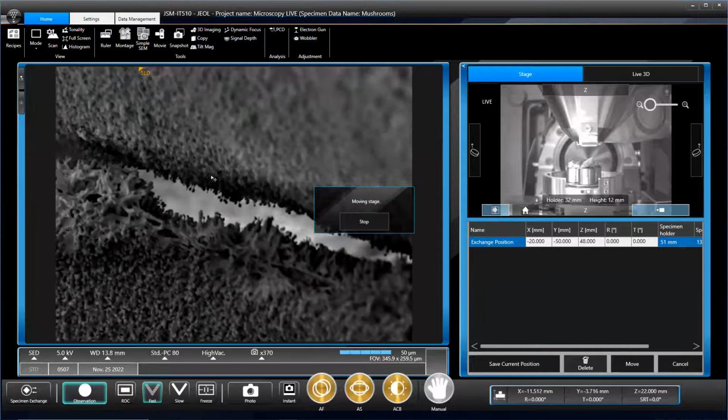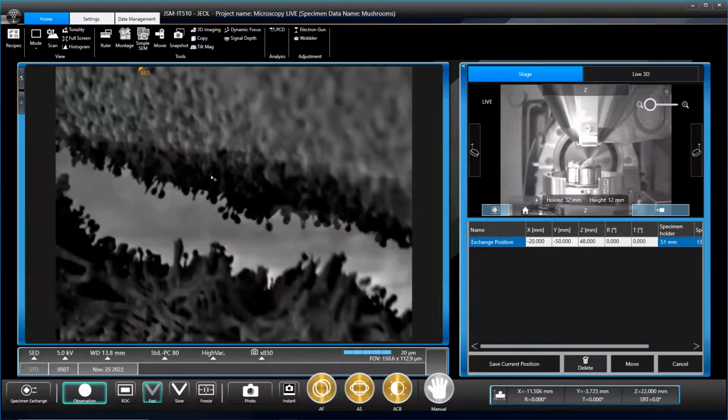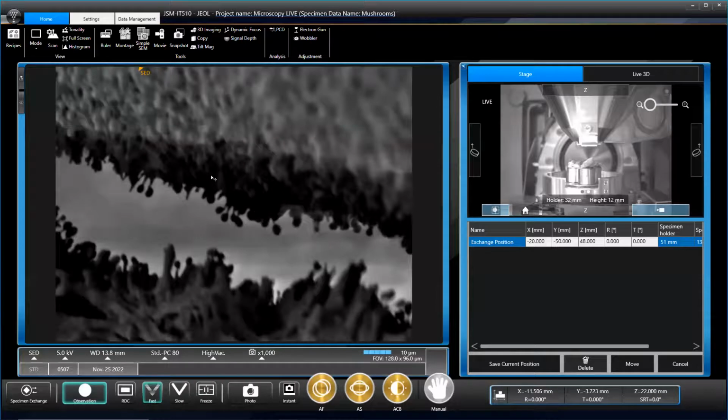Nicely arty as well. Oh, this is nice. And probably a good one to finish on, because we've got 5 minutes left. So here we go, this is initialized. Got any final questions, Kirsty? Now is the time to ask them.